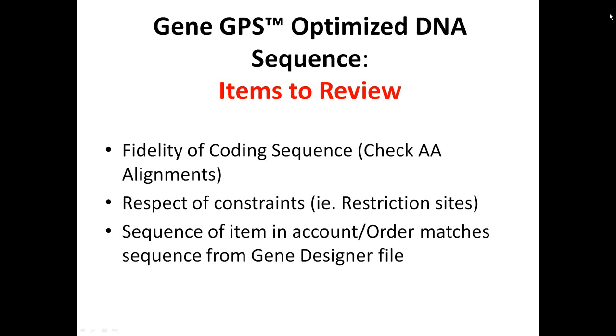So hopefully this was a very informative and quick way to get to the details that are necessary for reviewing a sequence that's gone through a gene GPS optimization.